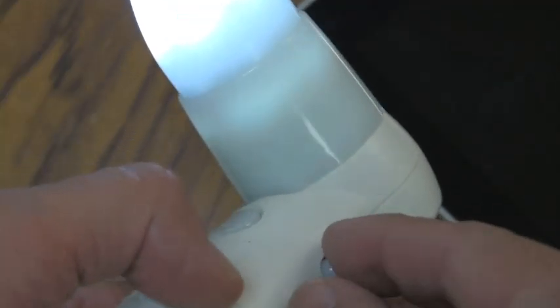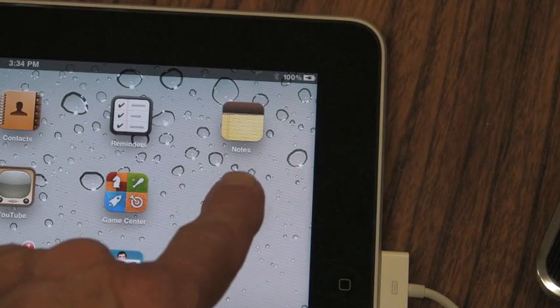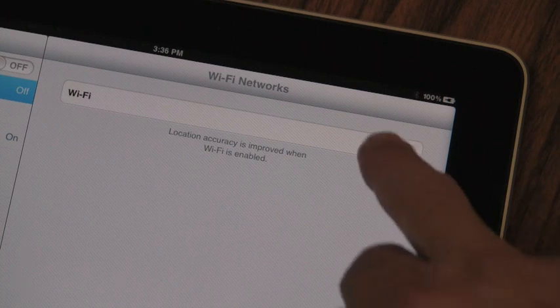Turn on the power, which is indicated by the white LED lights on the lens and the green power LED indicator on the handle. Go into the settings on your iPad and turn on Wi-Fi, because the ProScope Mobile is a Wi-Fi device.